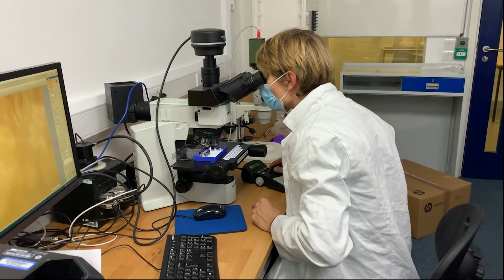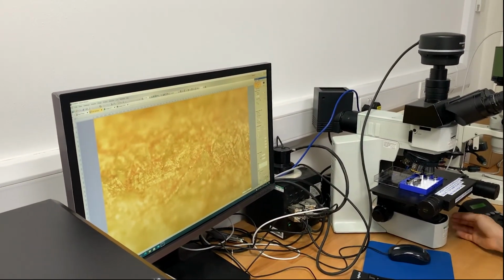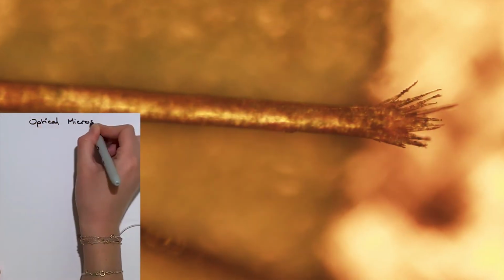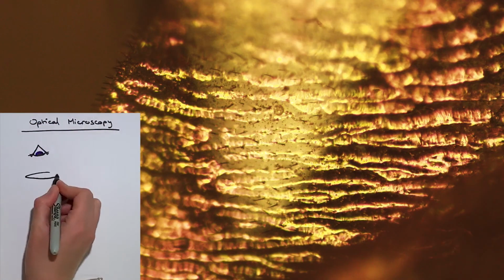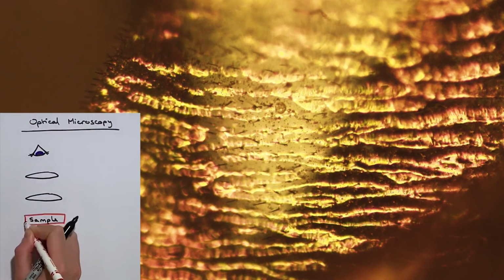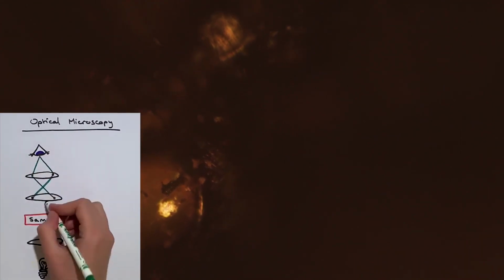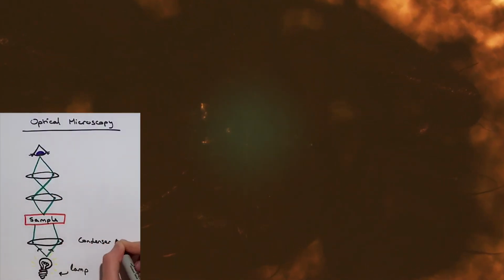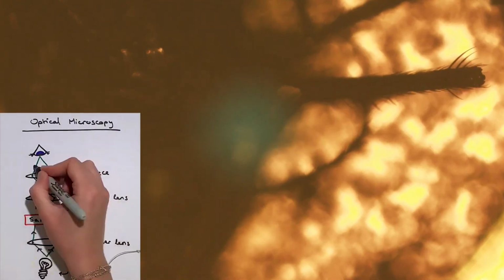Before the invention of the scanning electron microscope, or SEM for short, the only practical option was to use a light microscope. However, imaging small features with this technique is very difficult. The narrow range of focus makes it complicated to see 3D detail of a sample. Chemical treatments must be used to distinguish different materials, making identification complex. The maximum magnification, around 1,000 times, and shallow depth of focus makes it very hard to see the details on this fly.